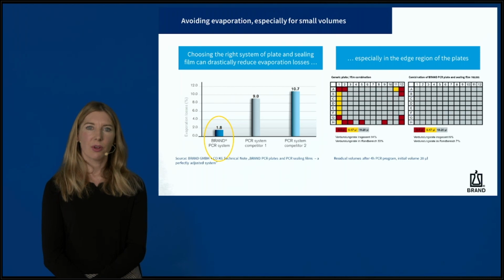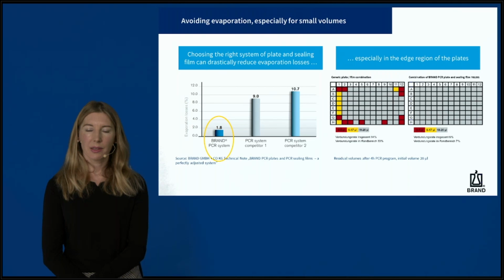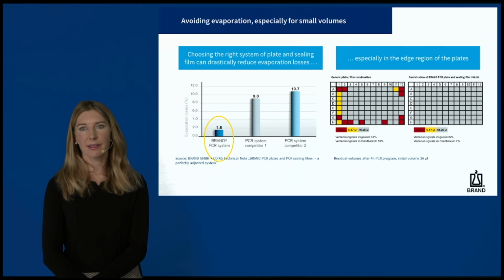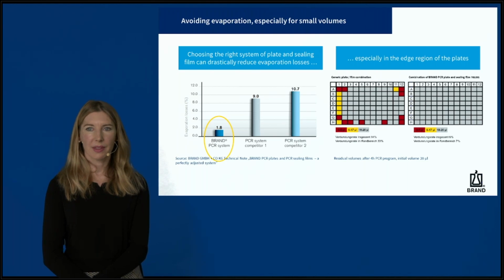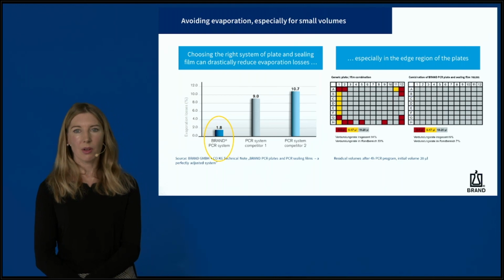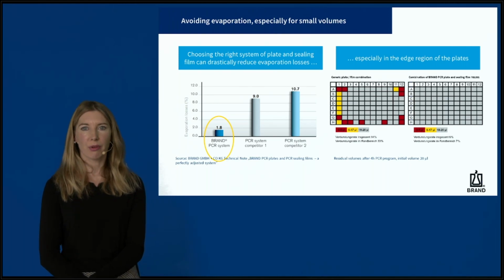As the reaction volume is very small, it is necessary to avoid evaporation. This picture shows the percentage evaporation losses of different PCR systems. In this case, we used a 96 PCR plate in combination with an adhesive sealing film. As you can see, there are really differences in the PCR consumables. Therefore, it makes sense to optimize not only the PCR reaction mix, but also the choice of PCR plastics. In the picture on the right side, the remaining volume after a 4-hour PCR program is shown graphically.